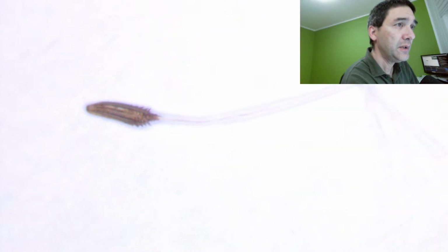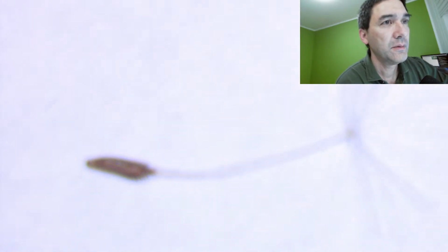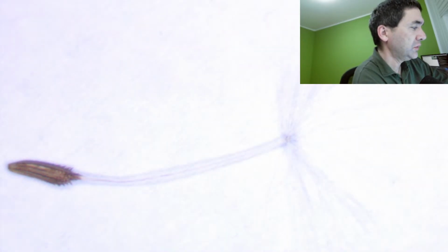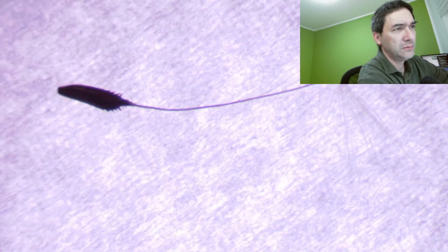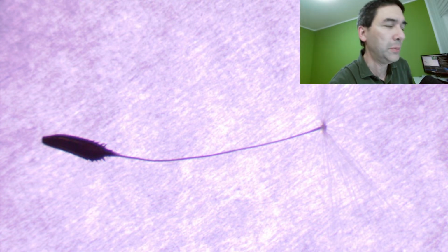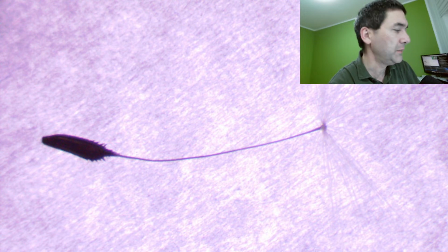Stereo is also nice sometimes. Here it is. Ooh, way too bright. You're just able to find it. I'm wondering if maybe I should not turn on the light from the bottom. The wrong lamp. Here we go. In any case, that's basically how it looks under the stereo microscope. Not particularly good. I just realized I have to optimize this a little bit.